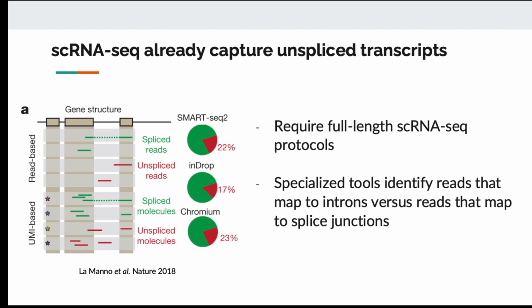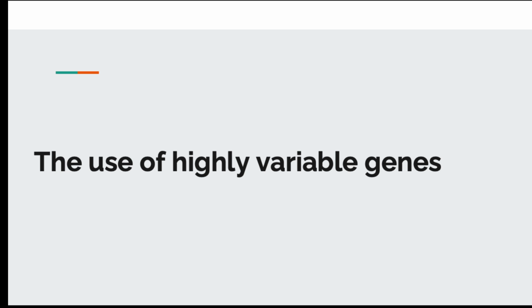So up to this point, we have seen the methods to visualize single-cell data, how we can identify cell type in the data, and how we can infer the trajectory in the data. One of the things that I highlighted at the start, and haven't mentioned yet, is that the choice of genes that we are going to analyze has an impact on all the results. This is important because in every pipeline that you are going to encounter, there's going to be one step that mentions this term, highly variable genes.